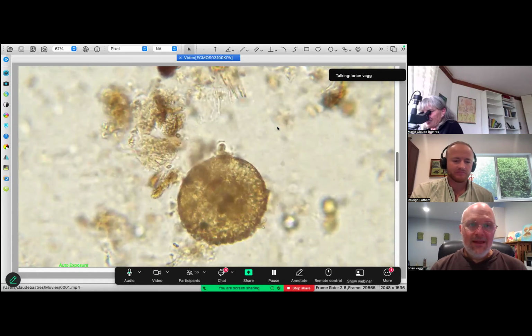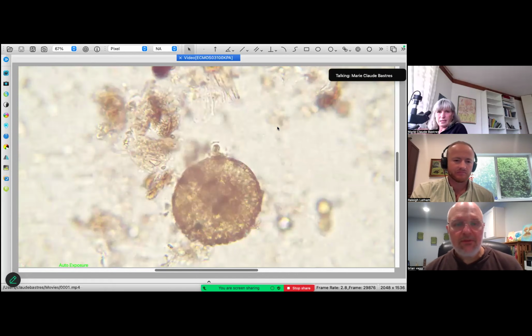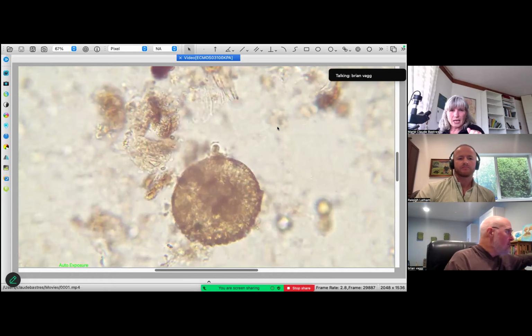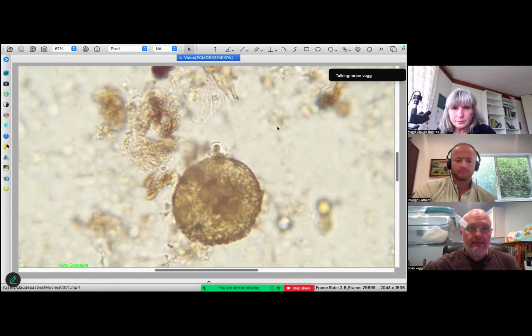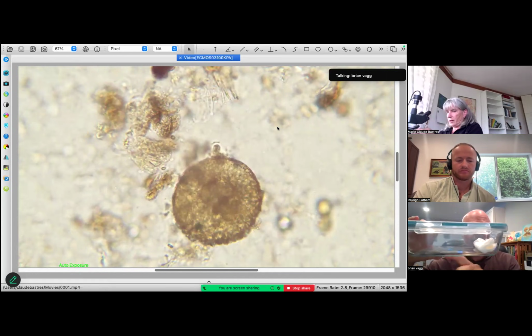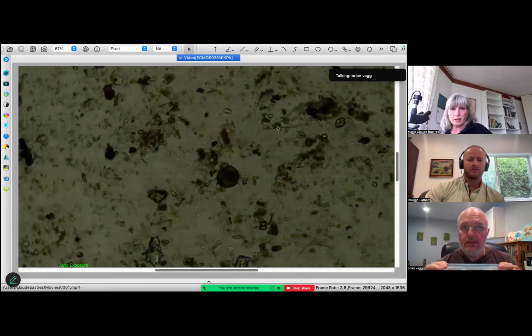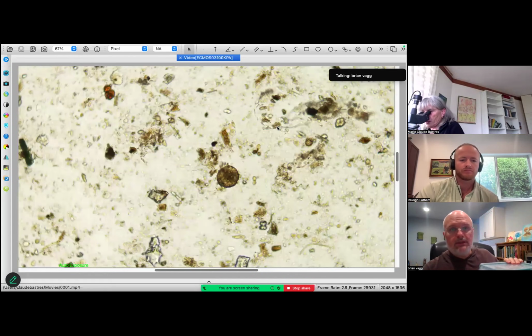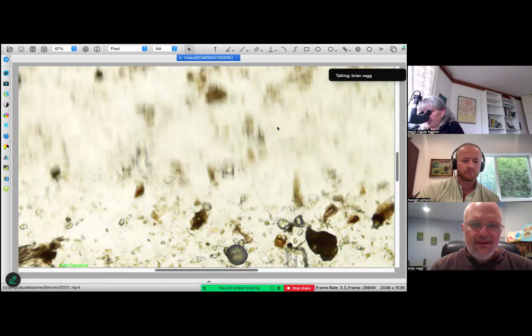There was a question that just popped up from Levin, who missed the explanation about how to keep a slide. I don't mean to interrupt you real quick. I use a container. This is a glass container, and I have a wet paper towel in here. Then I have my slide sitting in the very bottom. It's a humidity chamber, really. So your slides will dry up much less frequently. All right, Marie, sorry to interrupt there. No, it's okay. I needed the explanation as well.